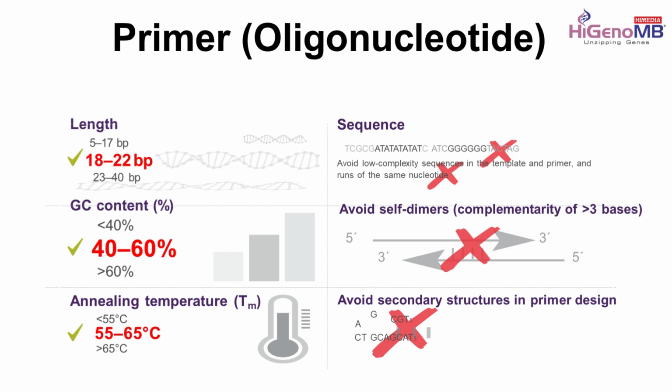When I say repeat, so GCT or ATG, the same set of nucleotides occurring in continuous occurrence, ATG, ATG, ATG. So this is the difference between a repeat and a run.